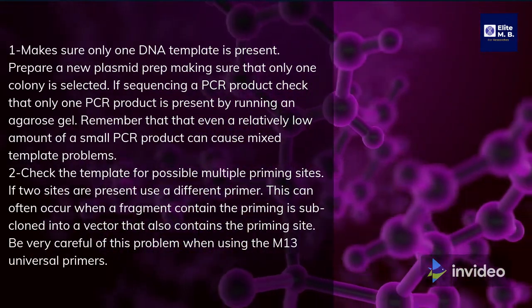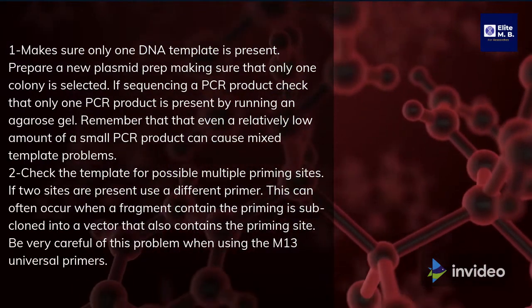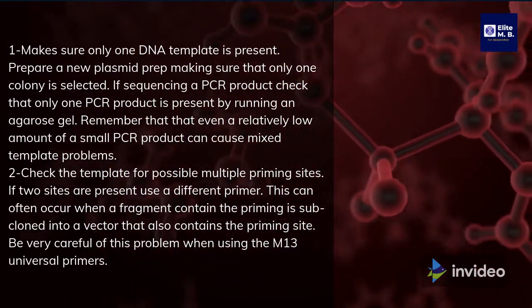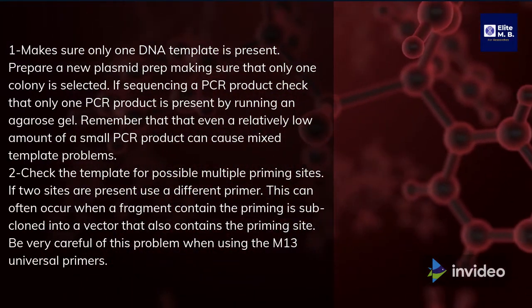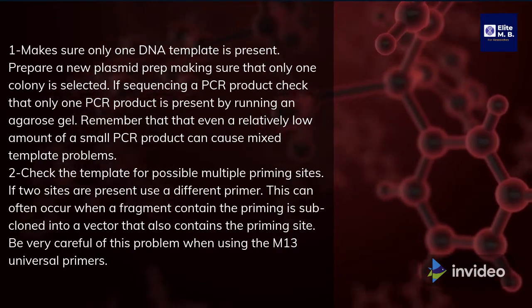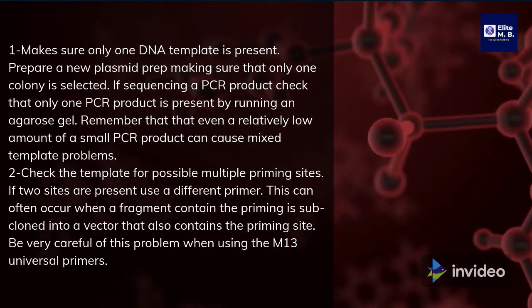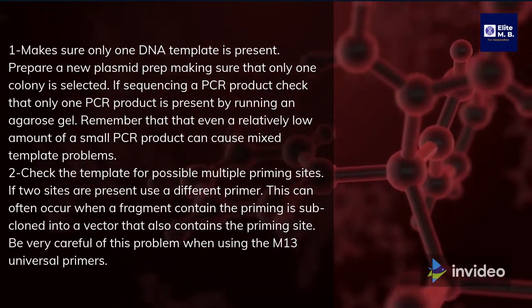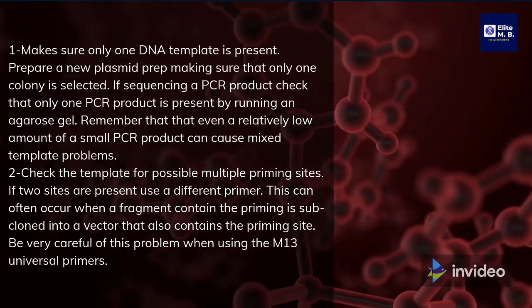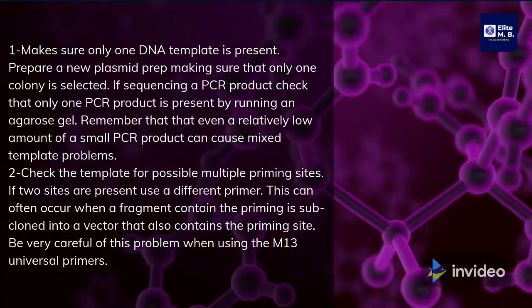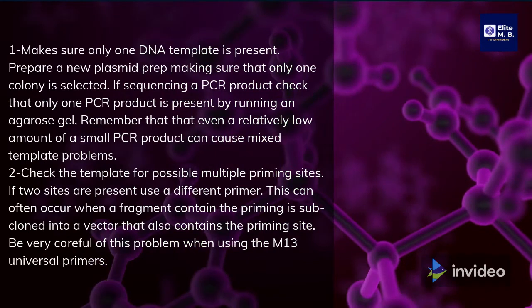Check the template for possible multiple priming sites. If two sites are present, use a different primer. This can often occur when a fragment containing the priming site is subcloned into a vector that also contains the priming site. Be very careful of this problem when using the M13 universal primers.